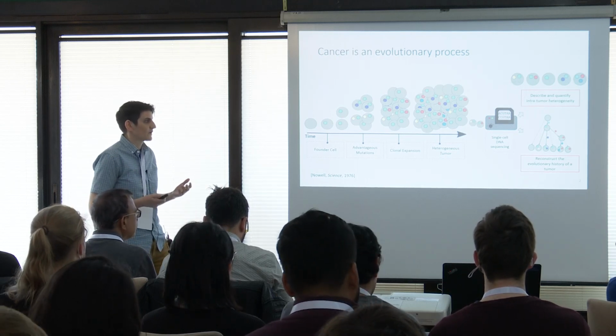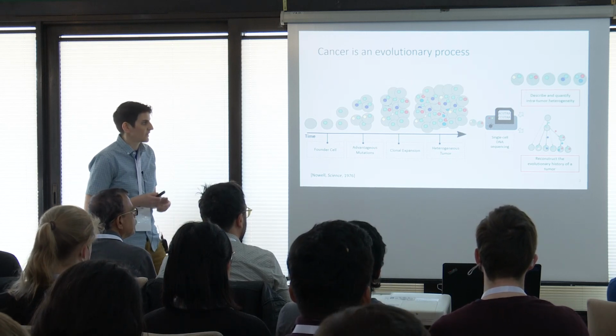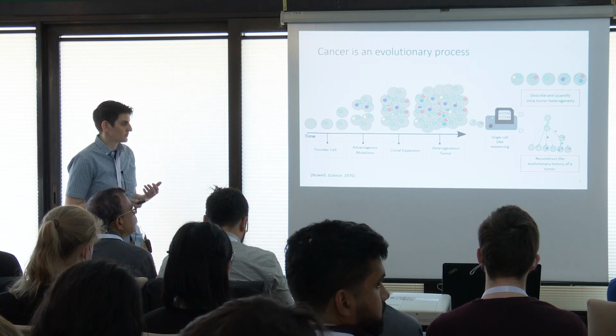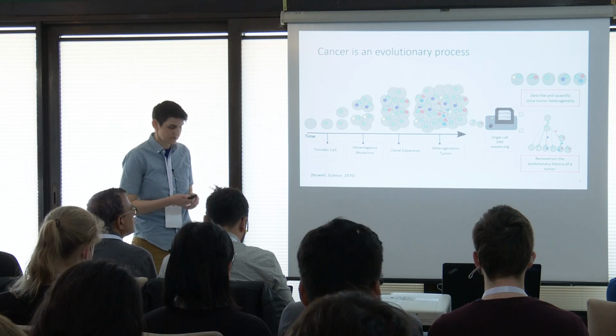One high-resolution way that we can study this evolutionary process is with single-cell DNA sequencing. With that, we can identify the clones and quantify the intratumor heterogeneity, as well as reconstruct its evolutionary history in the form of a phylogeny or a clonal tree.